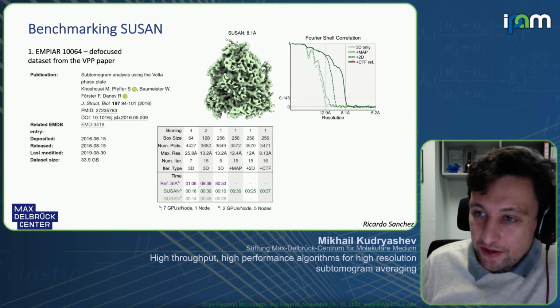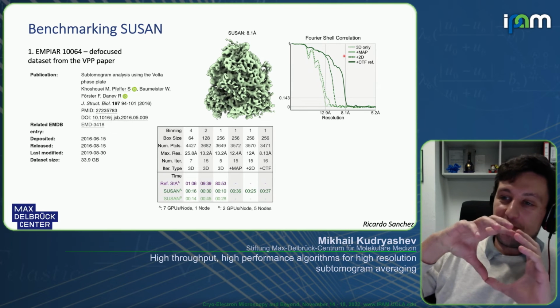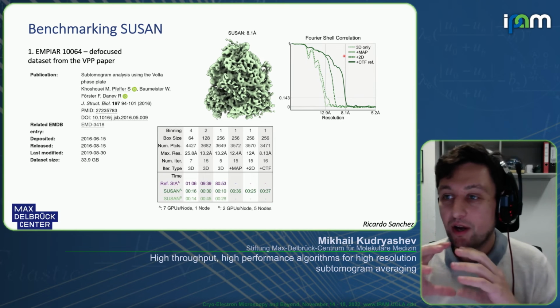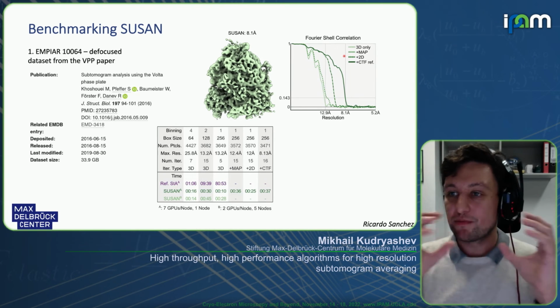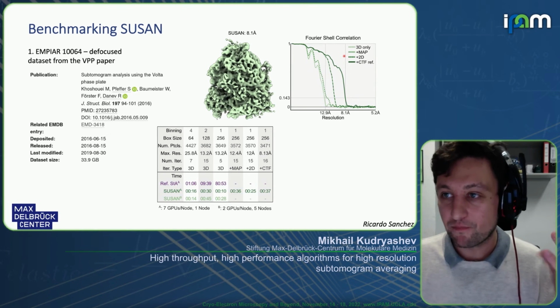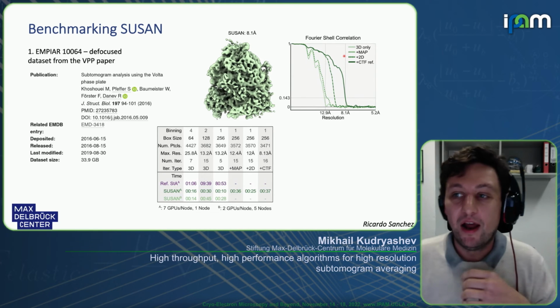So the big difference is that the alignment with substacks is first done with rigid body rotations, right? So you essentially know the relationship between your projections, and then you run the alignment in full 3D.